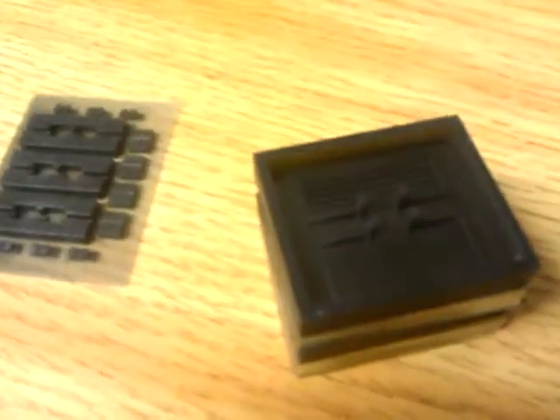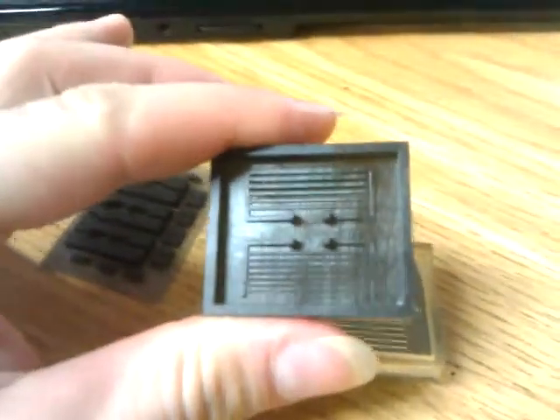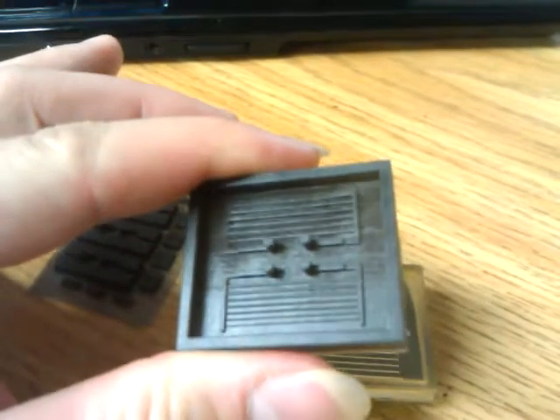So, hi. These are molds for PDMS microfluidic chips with channels of different sizes and heights.